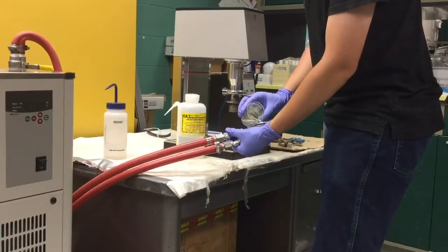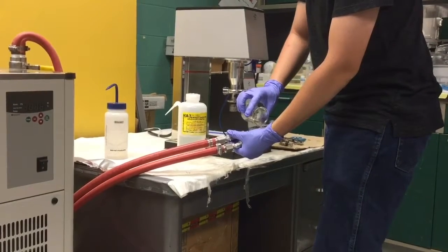Pour your solution into the cell. Do not fill beyond 30 milliliters.